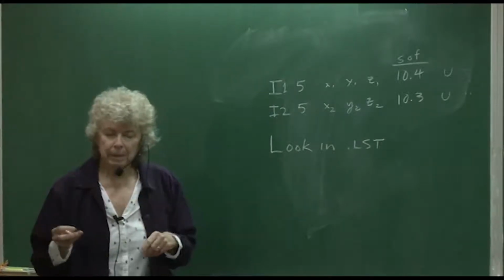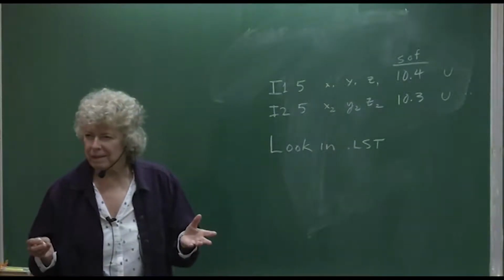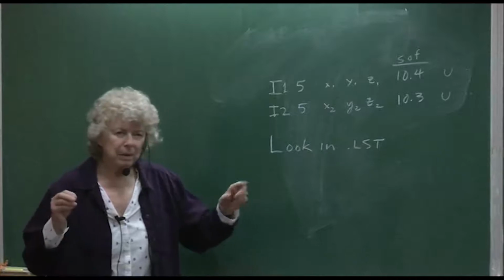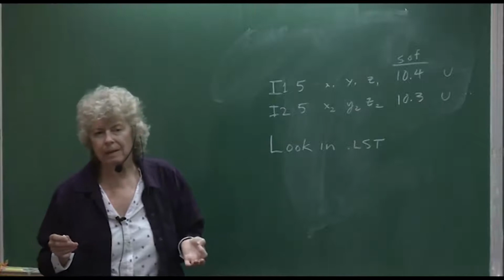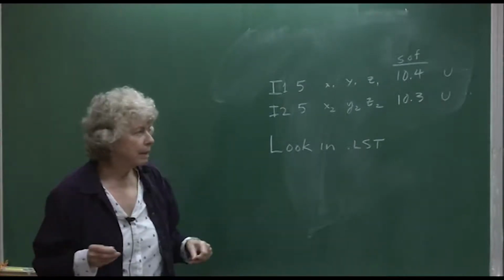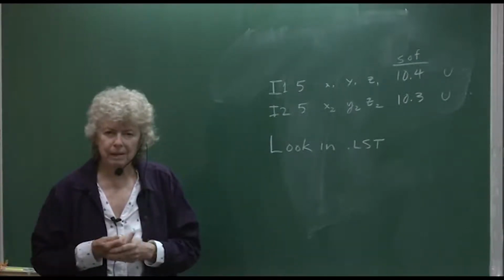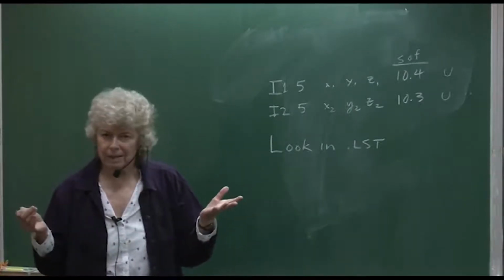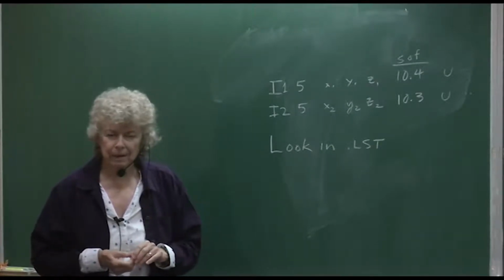You can divide it up into your molecules, however you're defining the molecules. So that number, the sum of all of these multiplied by the number of general positions, is going to equal what should be in the UNIT statement, and it also tells you how you can divvy it up so that you figure out how many molecules are in the unit cell and give you the Z value. So the Z might be the number of general positions, but if you have molecules that have symmetry, then it will be less than that.